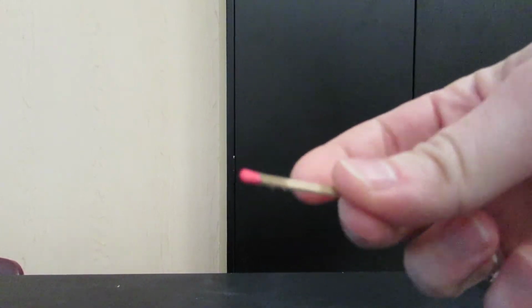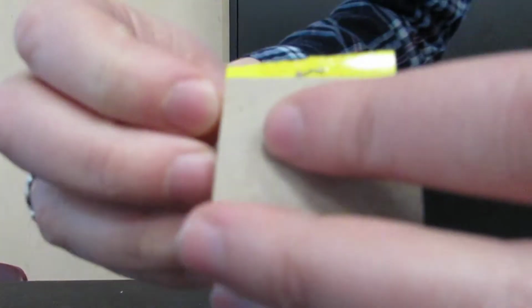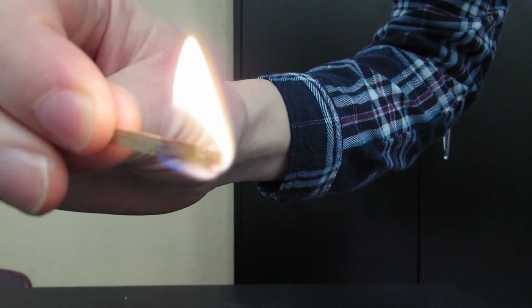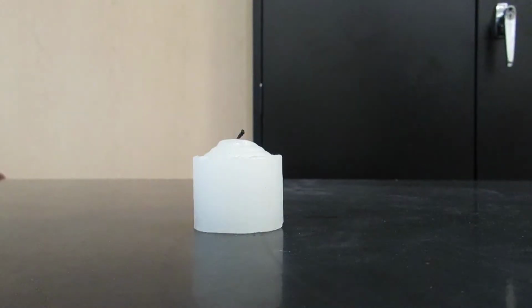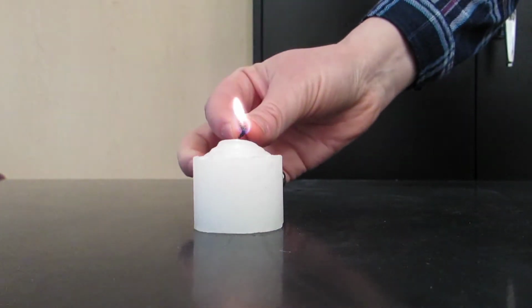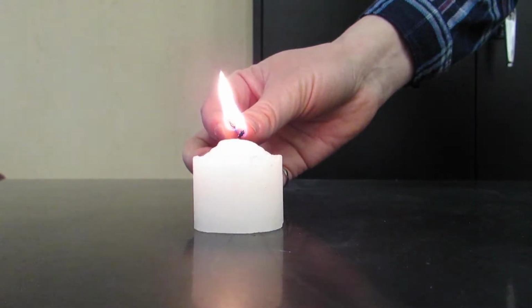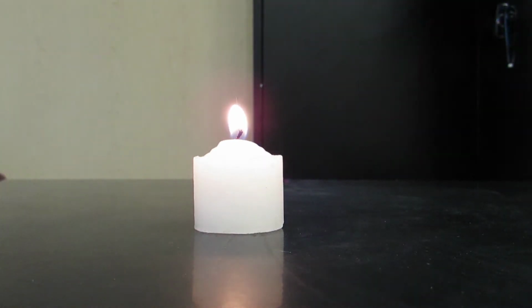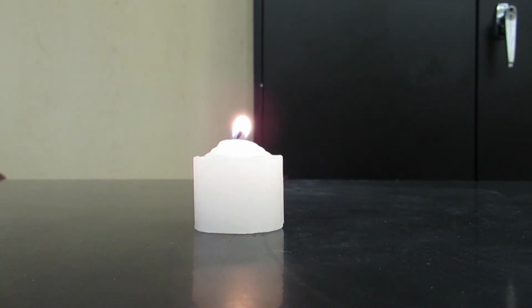So the first experiment is we're going to take a match and light it, and I want you to observe what happens. The next one is we're going to light a candle. So we light the candle with our match. We're going to let it burn for a little bit. And then I will blow it out.